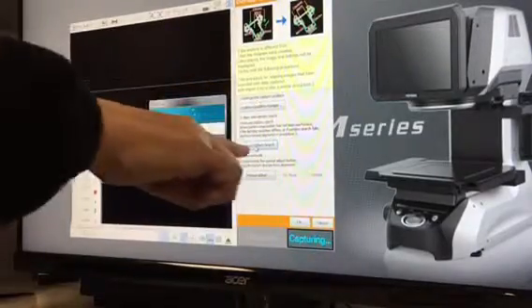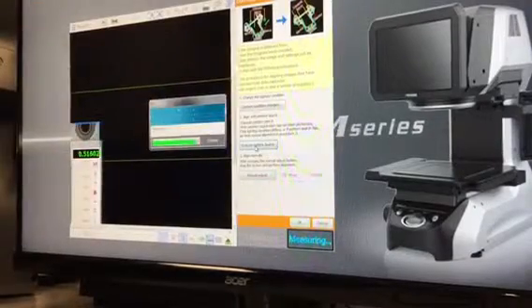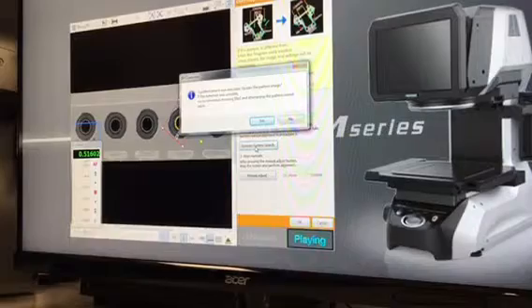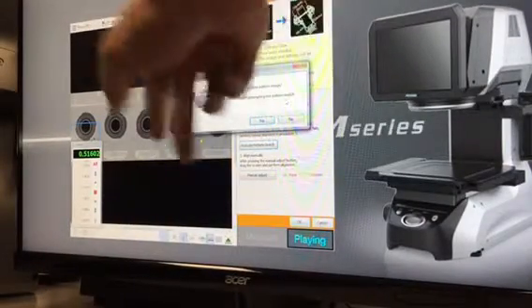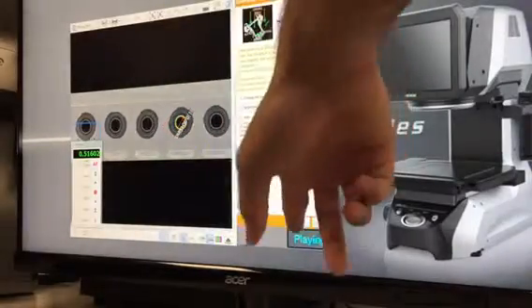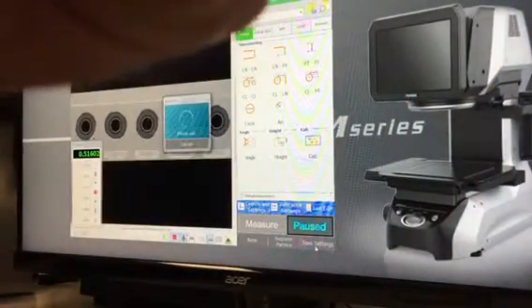So that one and this, okay. So you have to do all these two, 1 and 2. Yeah, that's what I'm wondering about. Because do 1, okay, 1, 2. So now we're just going to update the pattern. Say yes. Okay. Hit OK. And now save this. Save settings. Yep.